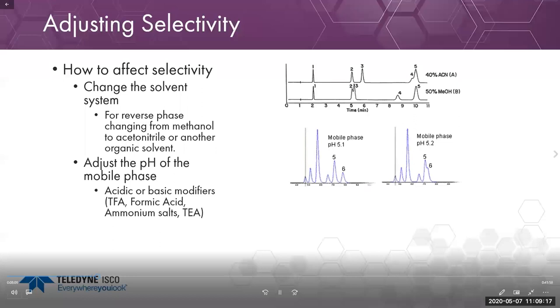Another component with a drastic impact on selectivity is adjusting the pH of the mobile phase. Adding acidic modifiers — TFA or formic acid — or basic modifiers like ammonium salts or triethylamine can change selectivity dramatically. In this example, changing pH by just 0.1 unit from 5.2 to 5.1 allows separation between peaks five and six, whereas at pH 5.2, that separation is not achievable.